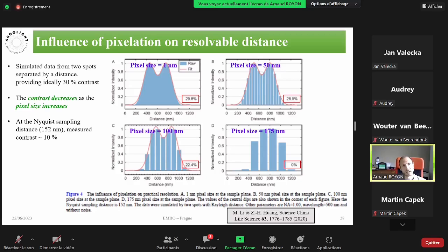The Nyquist sampling distance was about 150 nanometers in those simulations, equivalent to a contrast of 10%. And their conclusion was that to preserve the contrast, a sampling period of about 1/3 of the theoretical resolution is necessary.